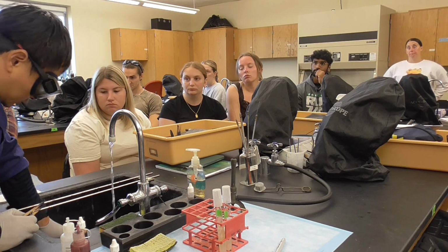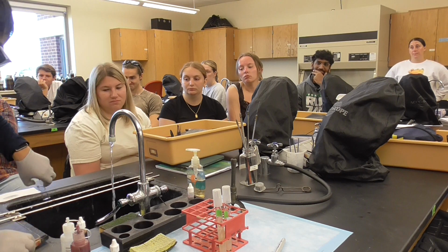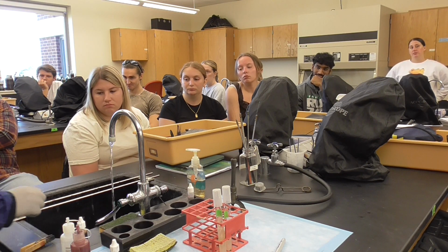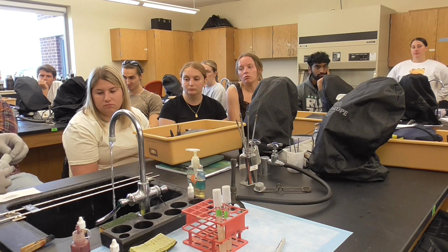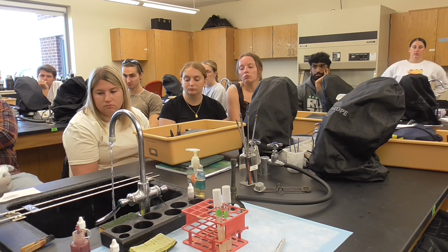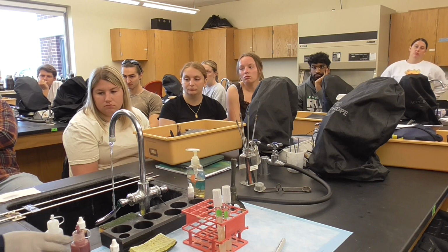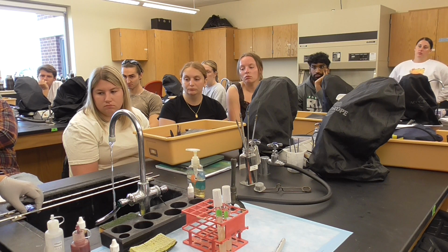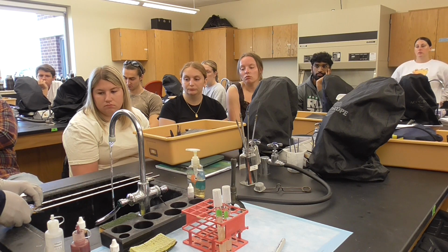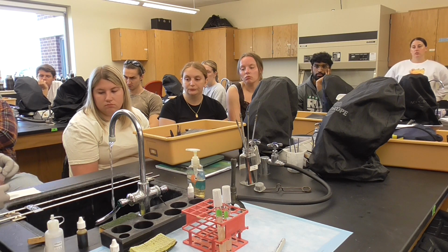Oh, that's not good. This may not be good. Then the decolorization is alcohol. That's real quick, for 10 seconds. We're going to count 10 Mississippi. And we rinse it. And then we counterstain with safranin.